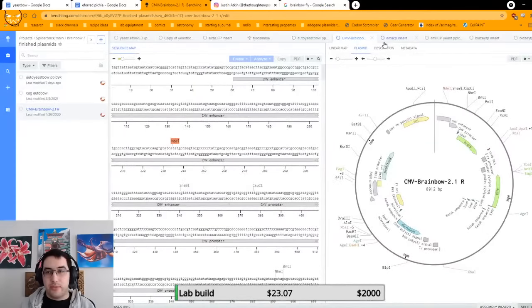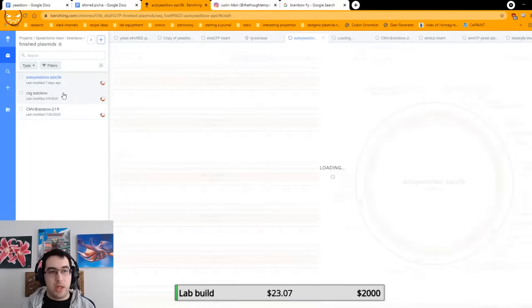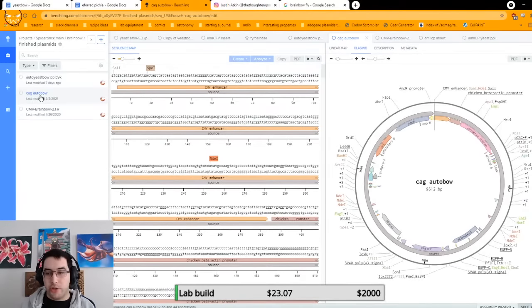I designed something else. So I designed this. This was based off of, okay, so this one says CMV Brainbow. This one says CAG Autobow. So this is what I based my thing on, but we'll explain why in a second.